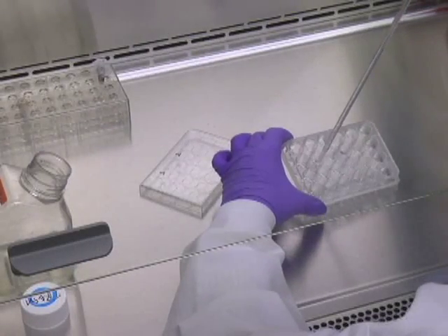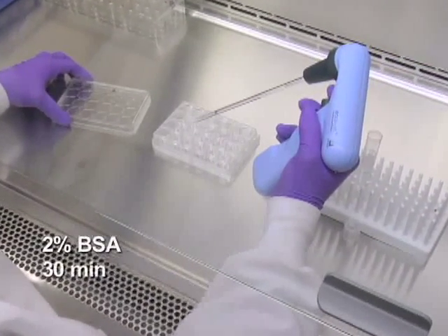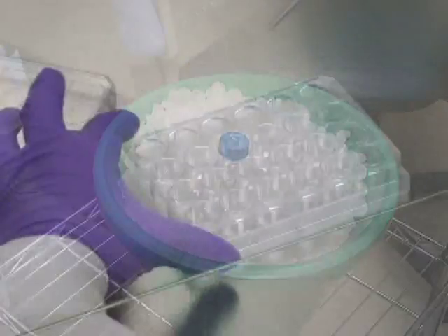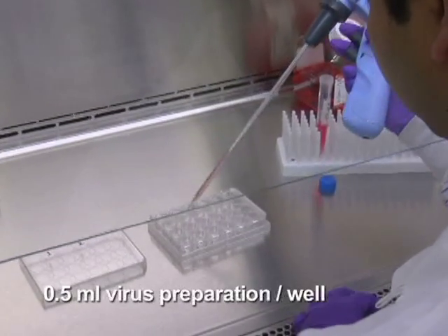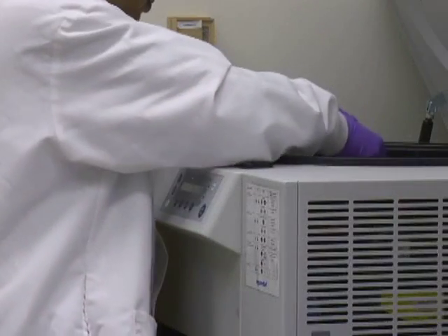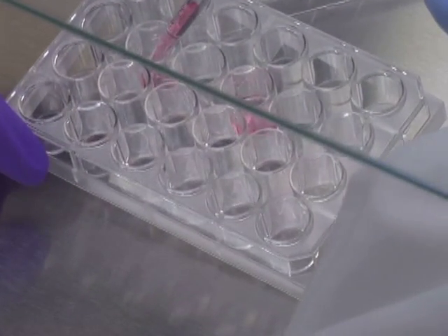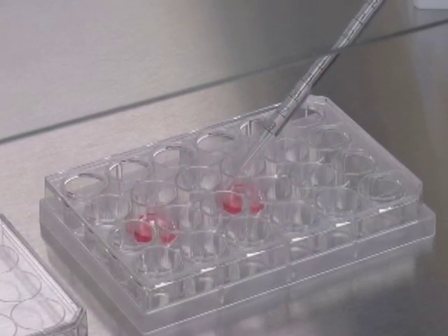Remove the retronectin solution and coat each well with 2% BSA by incubating for 30 minutes at room temperature. Meanwhile, thaw out the virus stock solutions and store on ice. Then aspirate the BSA solution, load virus by adding 0.5 milliliter of virus preparation to each well, and centrifuge at 2200 G at 4 degrees Celsius for 15 minutes. Remove the virus solution from the wells and repeat the virus loading three more times. Finally, rinse each well with cold IMDM medium.